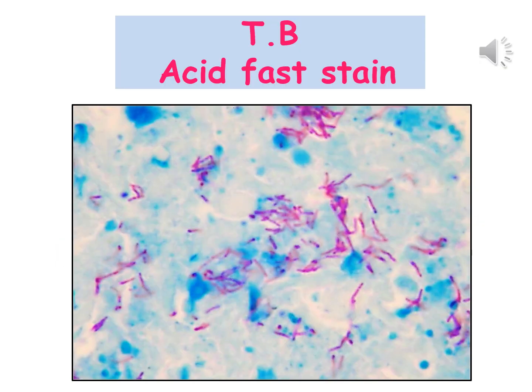This slide reveals the acid-fast stain result. Mycobacterium tuberculosis appears in red to pink color while other cells and the background appear in blue.